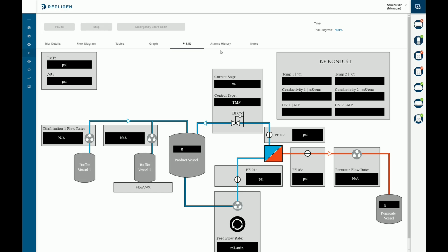Anything else on this screen you were looking to highlight? No, I was just showing the end of the software before the poll question came up. Right. But we only have 2 more sections to go through.